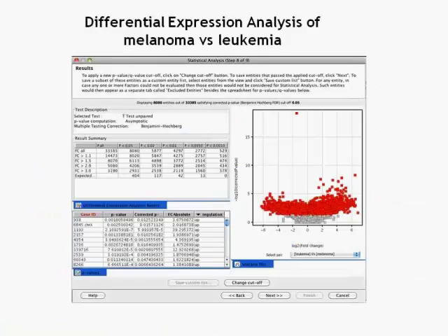In step 1, read counts are converted into normalized reads per million sequence per kb of the gene, or RPKM. And then these RPKM are compared between 2 classes of samples. Simultaneously, there are a large number of visualization aids also available in Avadis NGS to visualize the results of the differential expression. Here you can see a volcano plot that plots the relative up and down fold changes in expression against the negative log of the p-value obtained from the significance test, such as t-test or ANOVA.